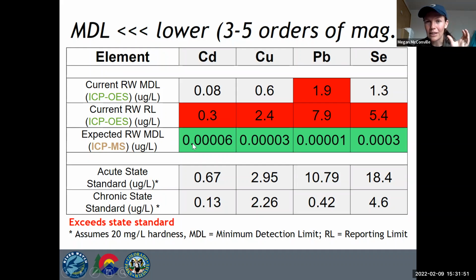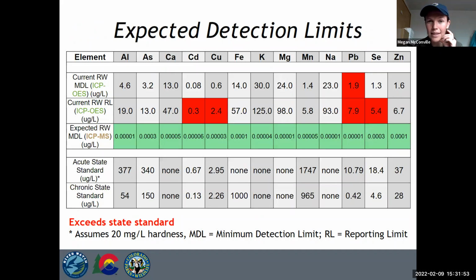And what's also really unique, if I scroll back one slide, you know, we're able to see magnesium, which we expect to be present in really high concentrations, milligrams per liter, what you could actually see, you could weigh out on your balance or your scale at home, maybe what you put on your toast or your pasta or whatever it is to make it more salty, that sodium or magnesium component, things that you can visualize, versus these part per trillion concentrations. That's, if we had 1 trillion people, it would be one person in that trillion. That's kind of where we get with these numbers.